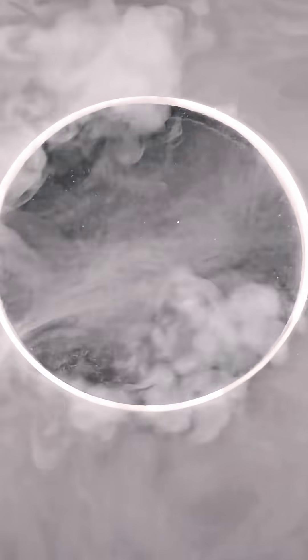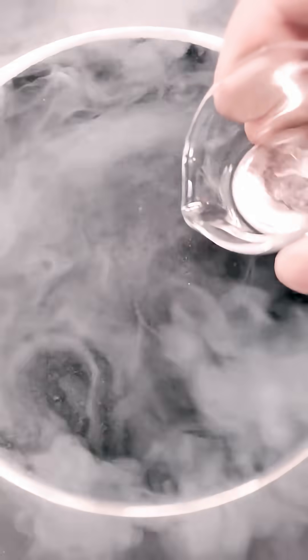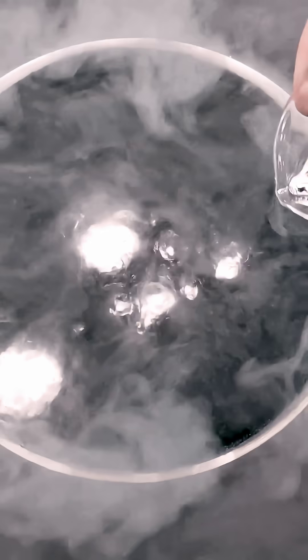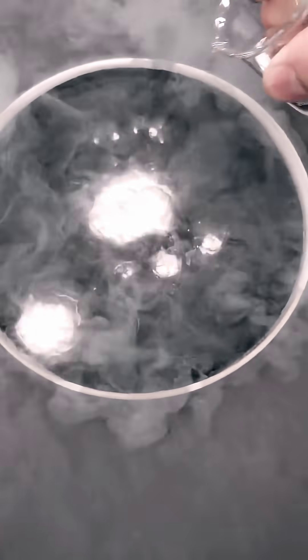Now it looks like it's good to go, and I can pour in some of the mercury. This is a few minutes later, and it's definitely solid.